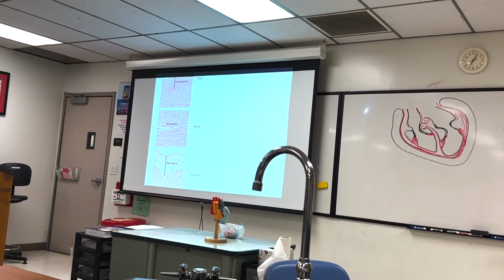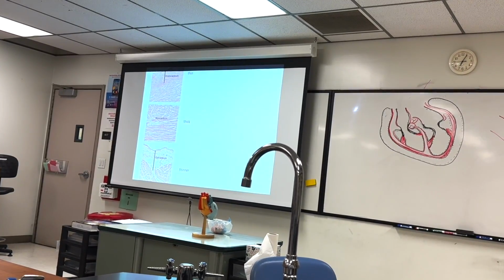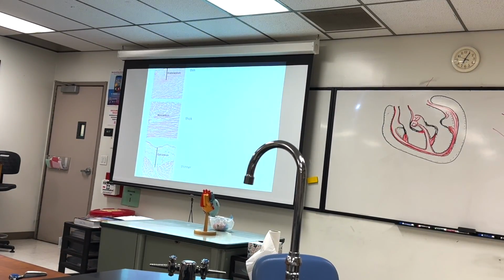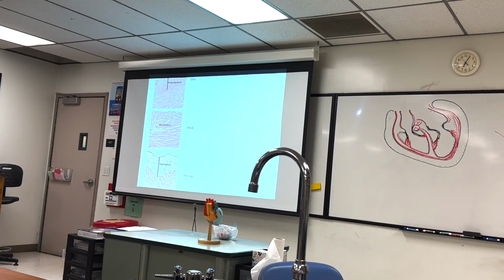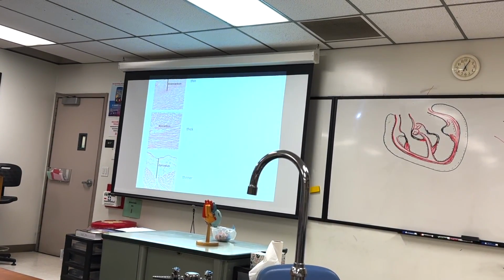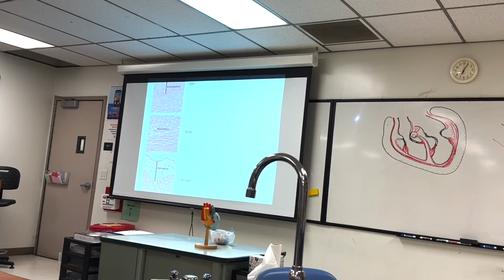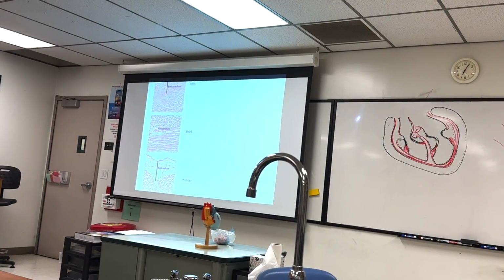That's also where we would see conductive cells, so the SA node and the Purkinje fibers and so on. We'll see some of the Purkinje fibers. The myocardium, of course, are the intercalated muscle fibers, the branched fibers. And the epicardium, as you'll see when you see the actual sheep hearts, has a lot of adipose tissue. That's what protects the surface of the heart and the blood vessels.